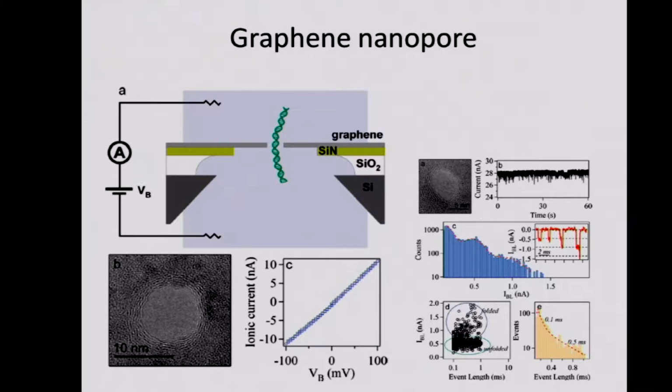These counts. That's sampling. These aren't constant things that are carried on. We don't have a continuous value of measuring the current. That's actually a sample. So it's measure, measure, measure, measure, measure, measure, measure. Anyone familiar with computer science recognizes what a sample rate is. So that's what these counts are. And it says it's translocating. Here's a better resolution. DNA is passing through, passing through, passing through.